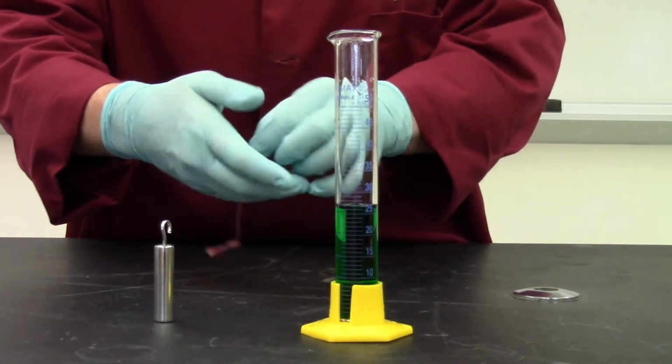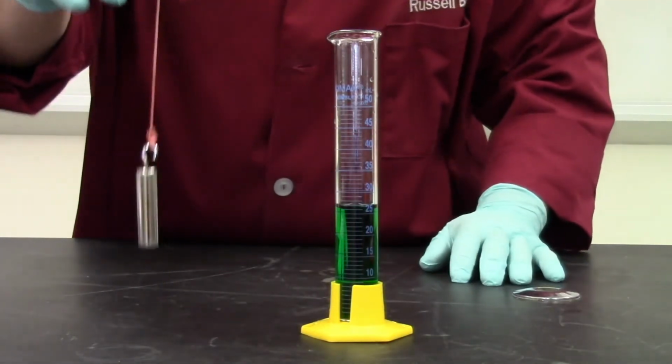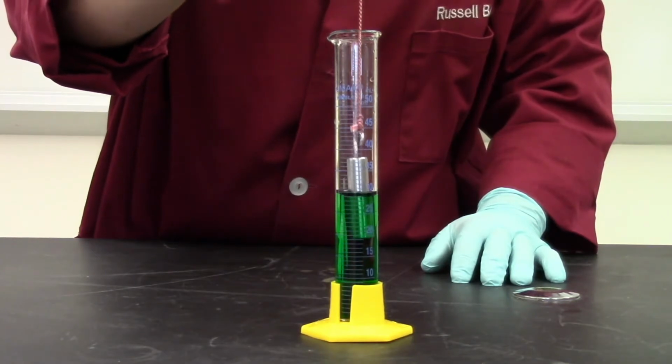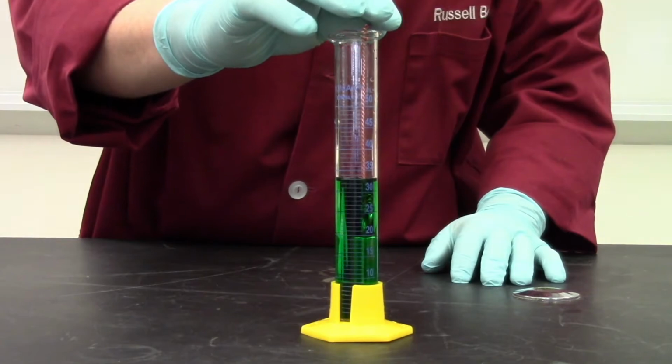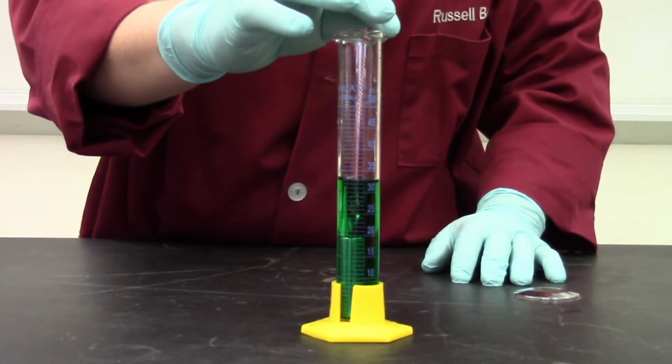Let me put the string around the cup hook. Take the object, place it into the water. Now watch the water level. Again, I'll show you the meniscus later so you can do your measurements. See how that water level significantly increased. Let me do it again, see? Watch the level decrease. Now watch it increase. There you go. That's volume by displacement.